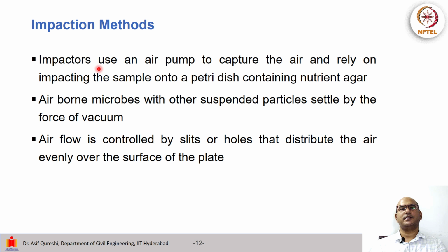Impactors generally use an air pump to capture the air and rely on impaction of the sample into a petri dish which is containing our nutrient agar. So somehow the air is being sucked and we are relying that the bioaerosol will impact onto the petri dish where we have our medium where they are supposed to attach to. So these airborne microbes, along with other suspended particles, will settle by the force of vacuum. So they will be sucked and they will attach to the medium.